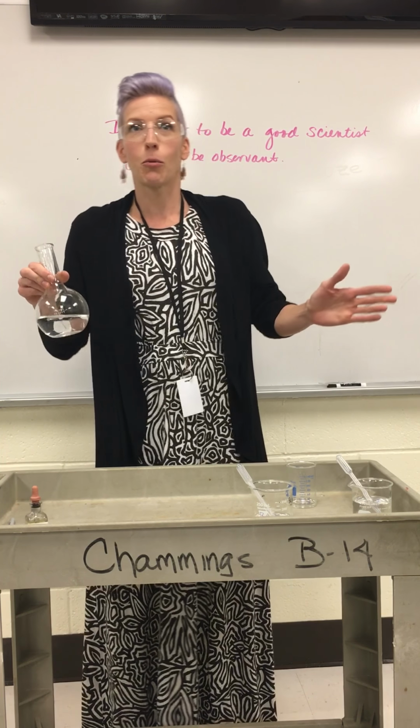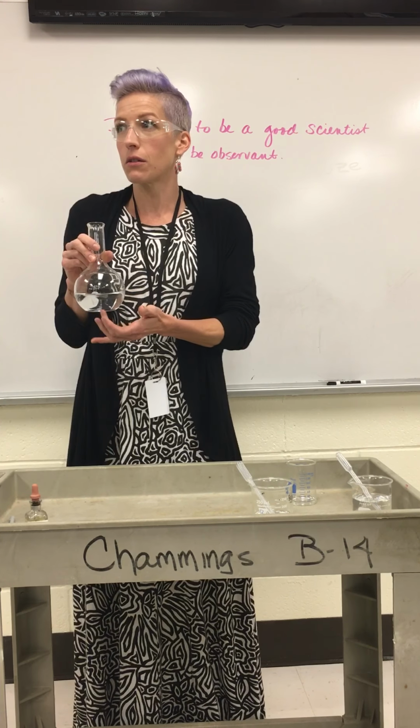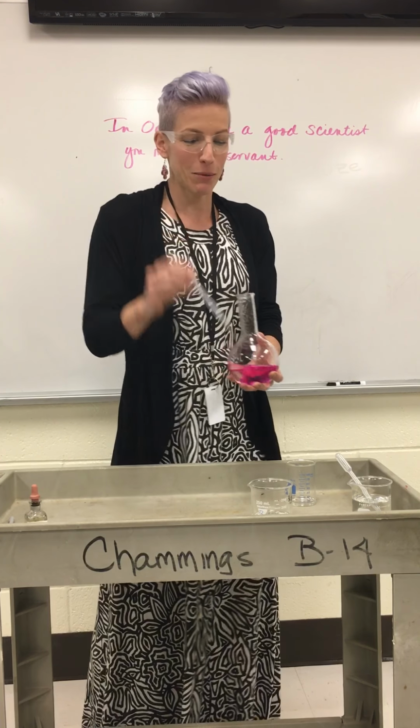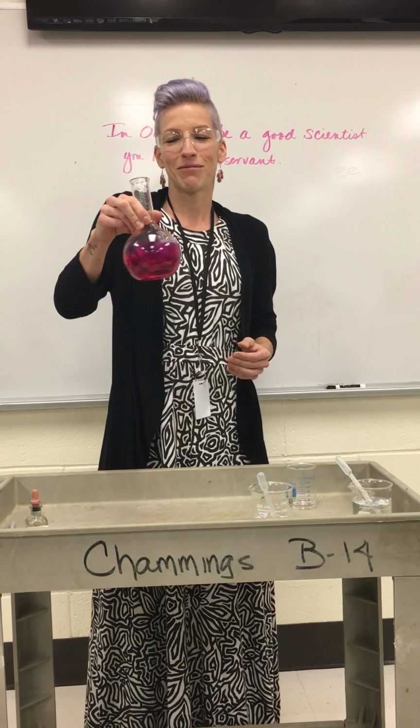Because that's basically it. There's no more magic after that. Any questions? Anybody want to put two things together? You just put more B. Put more B to put it back? Yeah, I hear you. Let's do that. Turn it back to pink. I don't know if that's going to be enough. Let's see. Isn't that pretty?